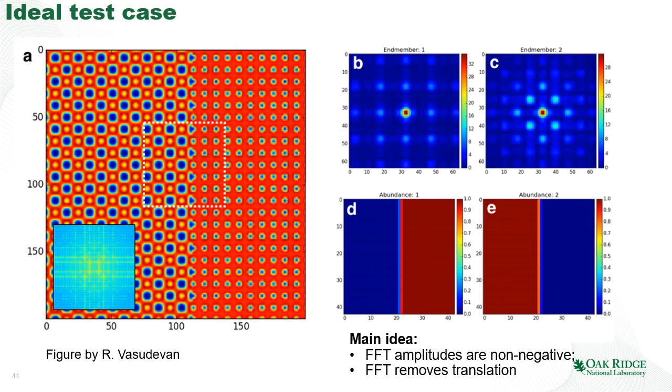In slightly more scientific terms, this means I want to perform the segmentation of the image based on the periodicity. And as you can imagine, realistically, this segmentation can be used to find the individual phases in electron microscopy data or different regions in scanning probe microscopy and so on and so forth. So what can we do? What we can do is to use this approach with the sliding window.